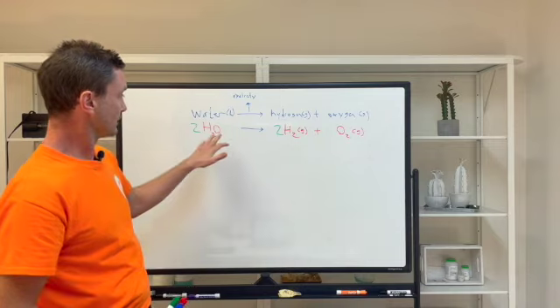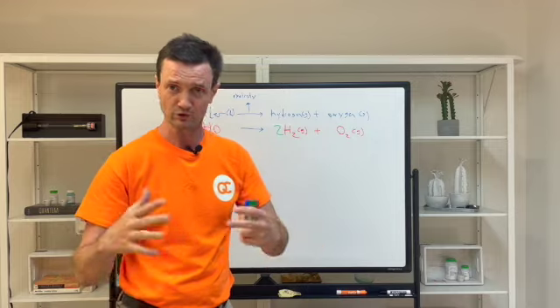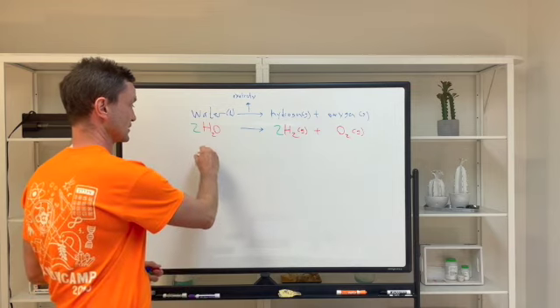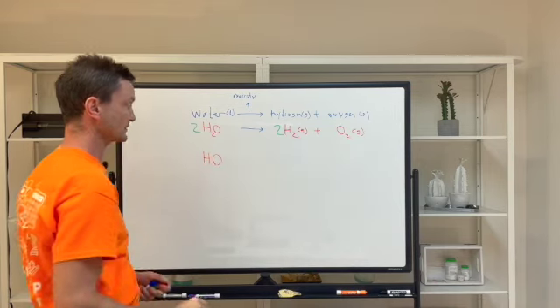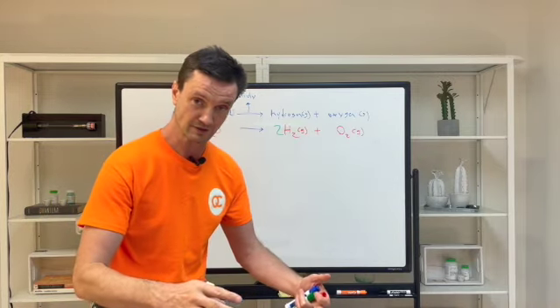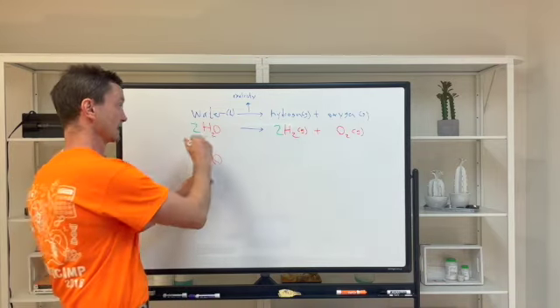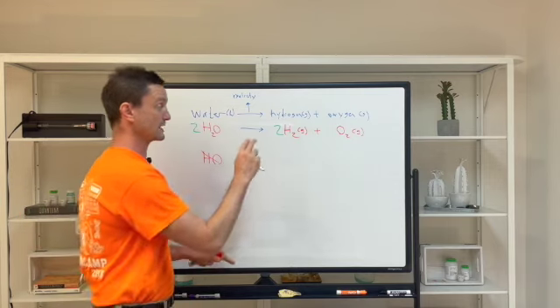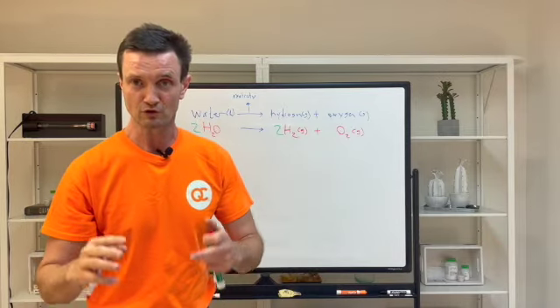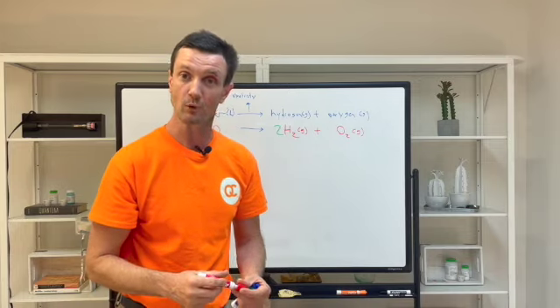Secondly, this other challenge in the history of science, once it was realized that water was not a pure element, was figuring out the actual molecular formula of water. It was assumed, just because this is the simplest, that the chemical formula was HO, and it wasn't until a few decades after the early 1800s that this was determined not to be the actual molecular formula, and this was determined to be the molecular formula, and it depended on this idea of equal volumes of gases having equal numbers of molecules. So 2 major things were overcome with this one lab.